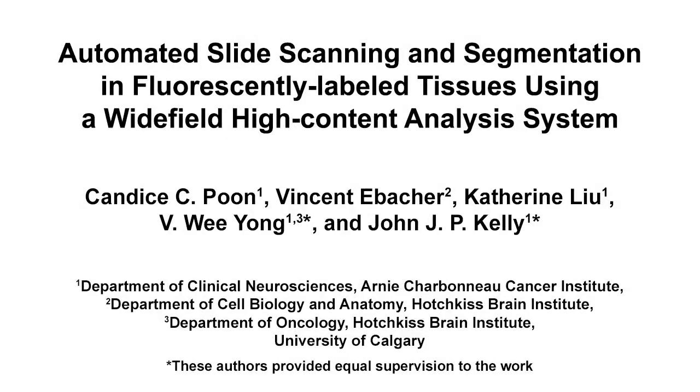The overall goal of this imaging and analysis method is to generate an easy-to-set-up workflow for the automatic segmentation of any fluorescently labeled slide-mounted tissue sample.